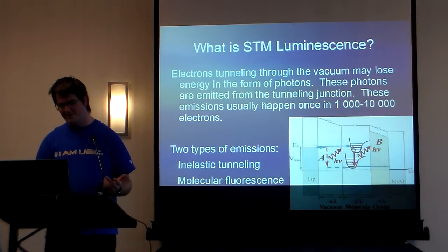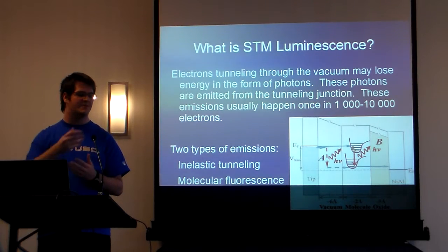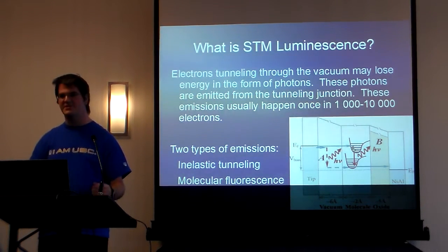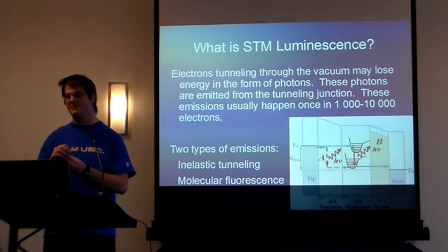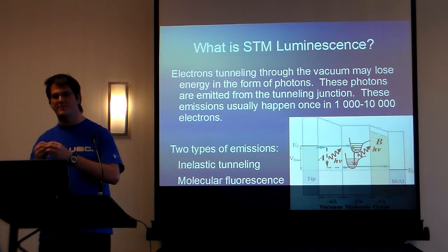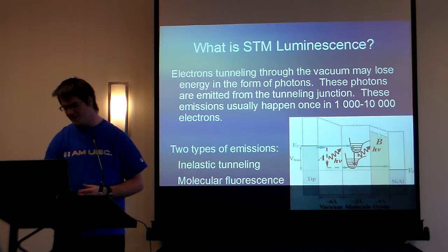And there are two types of emissions for STM luminescence. There's inelastic tunneling, which is just losing energy. And then there's also molecular fluorescence, which is if there's some molecule on the surface, the electron will tunnel into the molecule, lose energy within the molecule non-radiatively, and then emit a photon and keep tunneling.